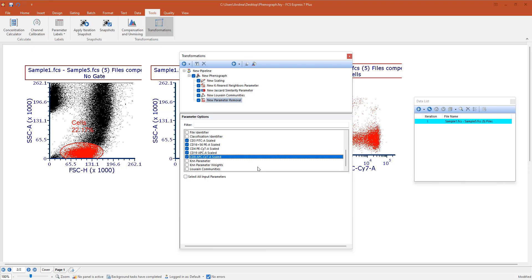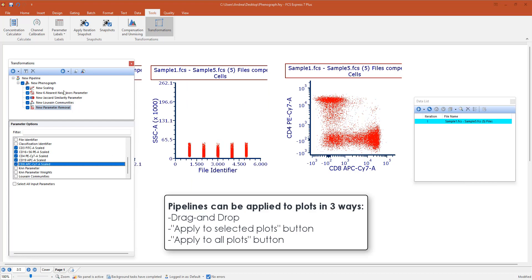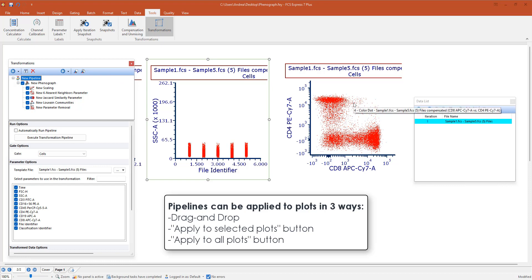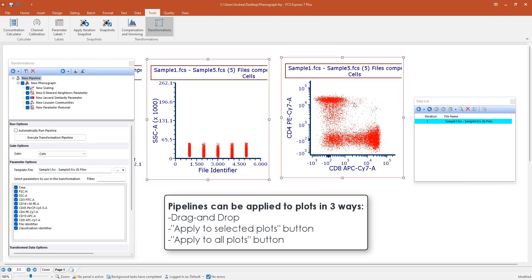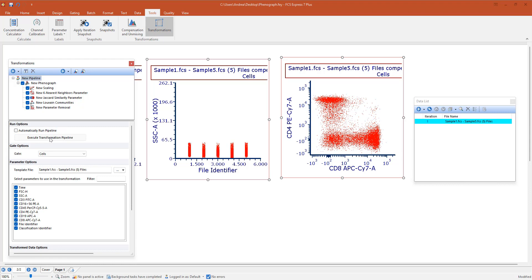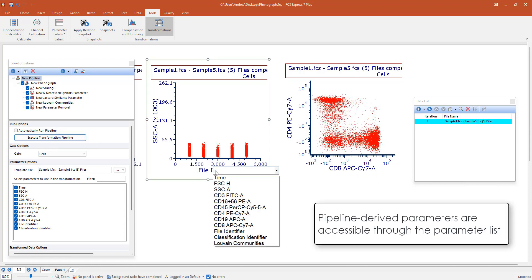Once you're ready, you have to apply this pipeline to plots. And there are a bunch of ways in which you can do this. You can drag and drop the pipeline on a plot or you can select multiple plots and use this button, apply to selected plot. You can also apply to all plots in the layout. Once you're ready, feel free to go back to the main pipeline body, press execute transformation pipeline and FCS Express will run the pipeline in real time.